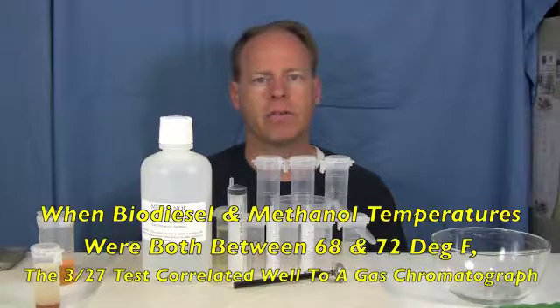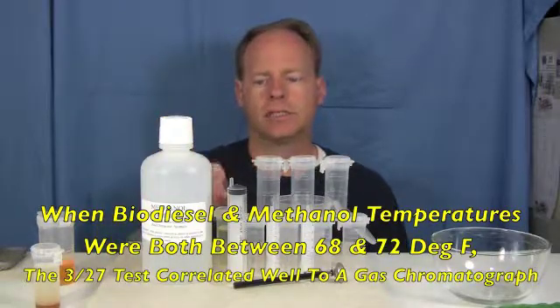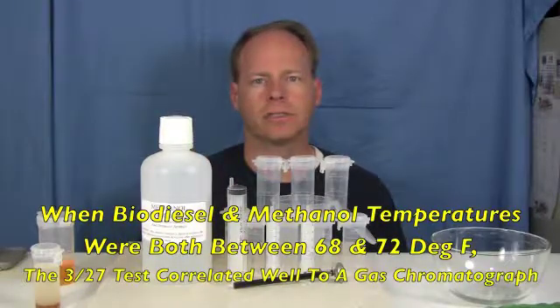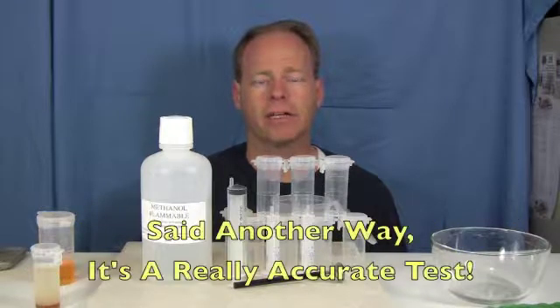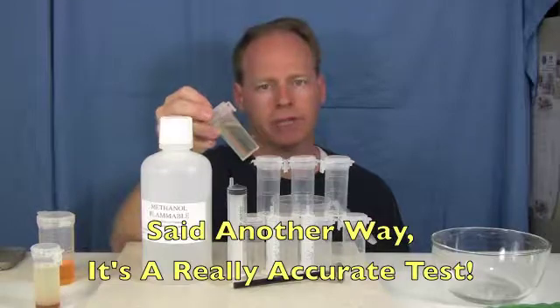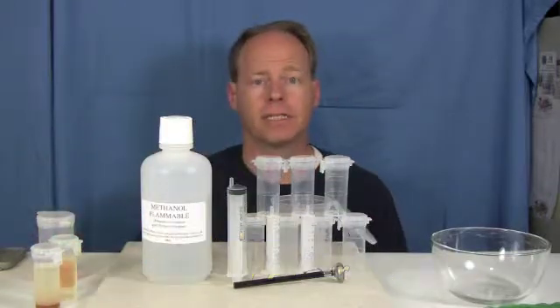What he found is that if the temperature of the biodiesel was between 68 and 72 degrees Fahrenheit, as well as the methanol, then the results of this test passing or failing highly correlated with the results passing or failing on a gas chromatograph. So thereby we have a very accurate but simple test that is fairly accurate to what you would get if you were to send it off to a lab.